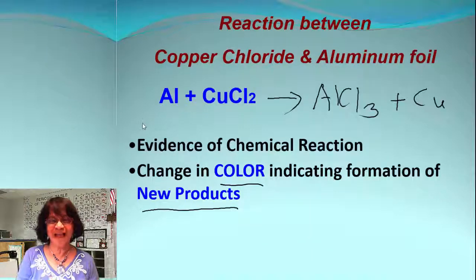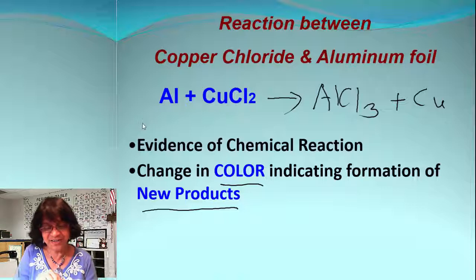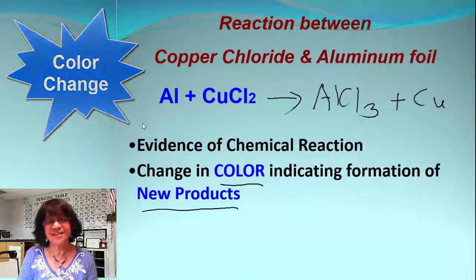Now, do you remember we left one reaction aside to see what happens? Let me get that spot plate out. Can you see this? The aluminum foil, which was shiny, has turned into a brown black color. That means we could confirm that a chemical reaction takes place.